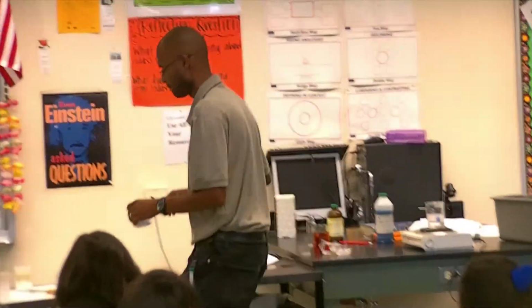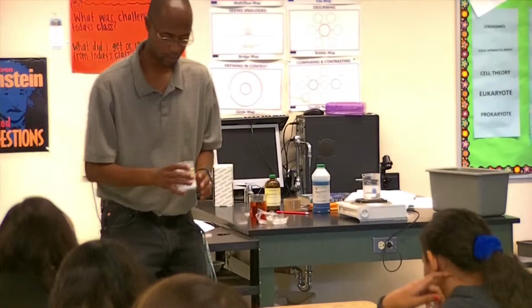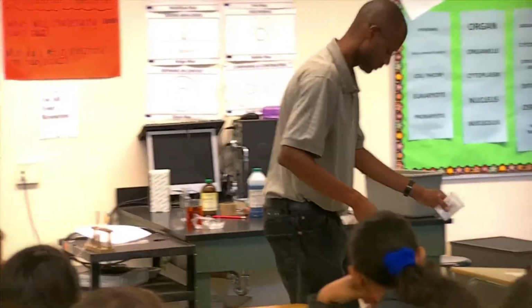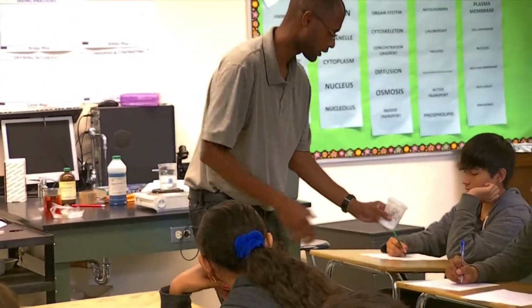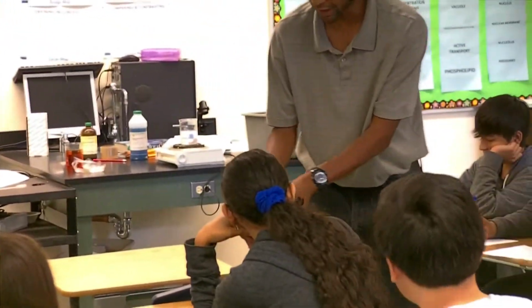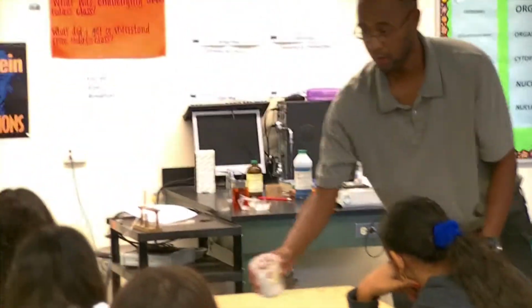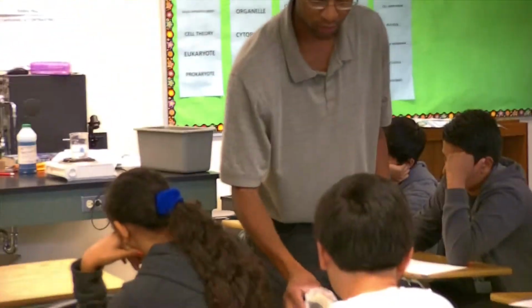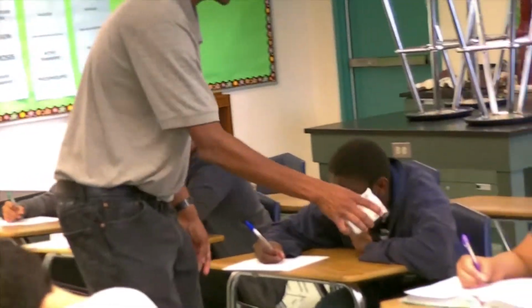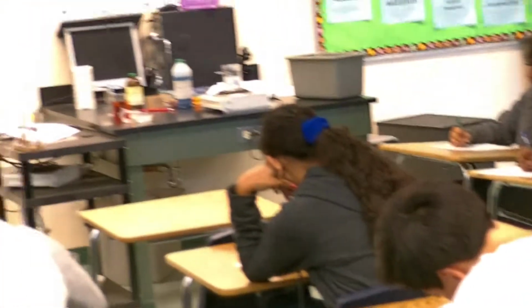That's glucose. The next one we have to look at is starch. Here is starch. This is what starch looks like. It's a little bit different. You've got to really look at it. It's thicker than that. It's more powdery, looks like flour almost.